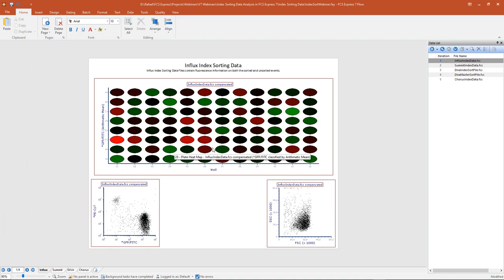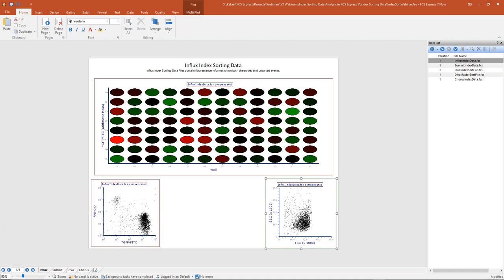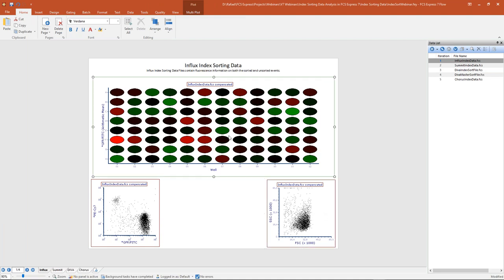It's important to emphasize that with our Influx data, right now on my two color dot plots below, we are looking at all of the events including the index sorted events. On my plate heat map, we contain only the index sorted events. To have a closer look at those, we're going to start by creating gates on each of these individual wells, which represent our sorted events on the heat map.